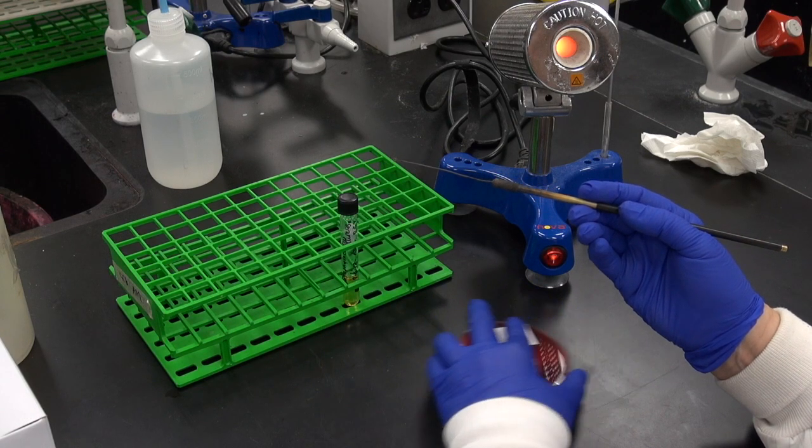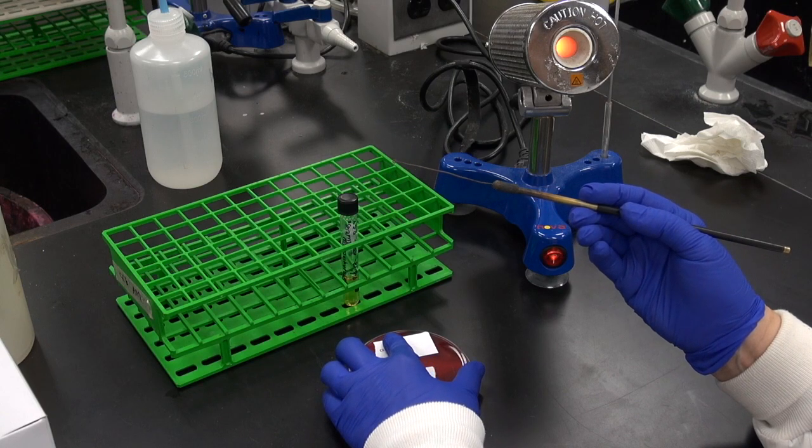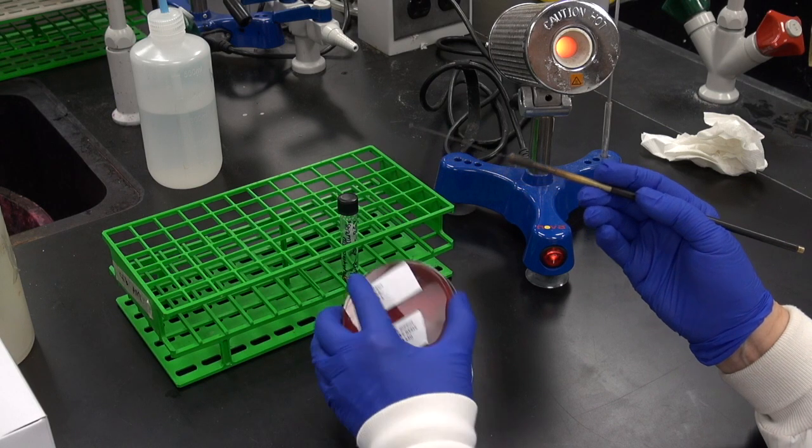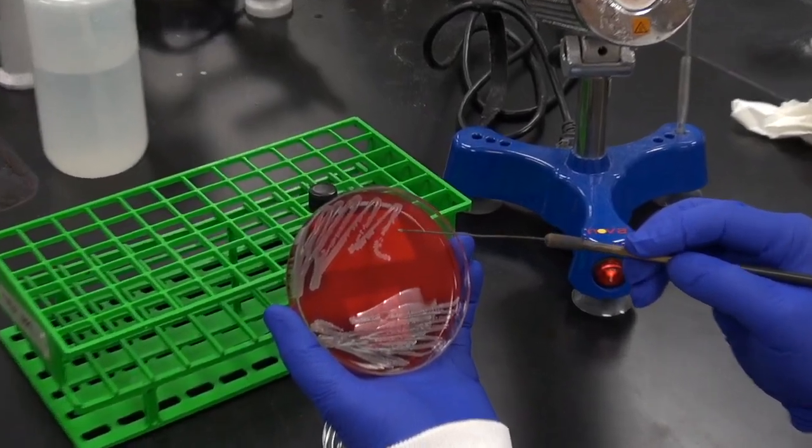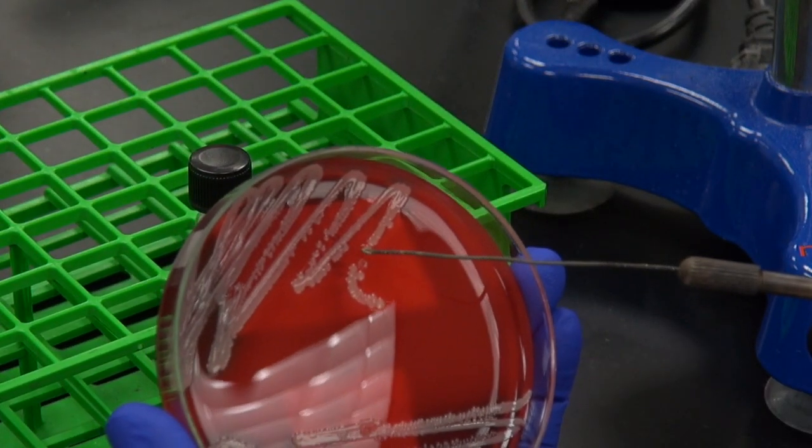Holding the loop in your dominant hand, open the culture plate and obtain some bacteria on the cooled loop by touching the center of a well-isolated colony. You don't need very much.